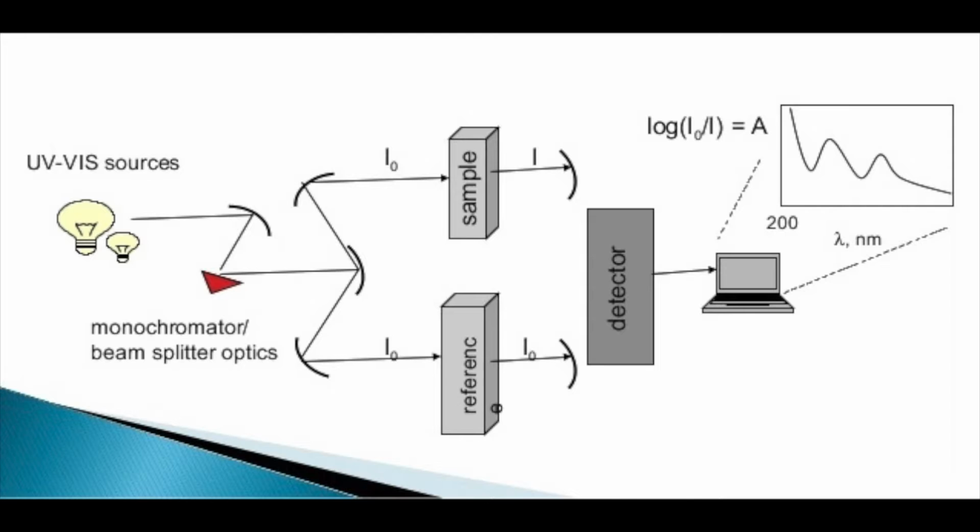Monochromator is generally composed of prisms and slits. Most of the spectrophotometers are double beam spectrophotometers. The radiation emitted from the primary source is dispersed with the help of rotating prisms. The various wavelengths of the light source, which are separated by the prism, are then selected by the slits. The rotation of the prism results in a series of continuously increasing wavelengths passing through the slits for recording purposes.